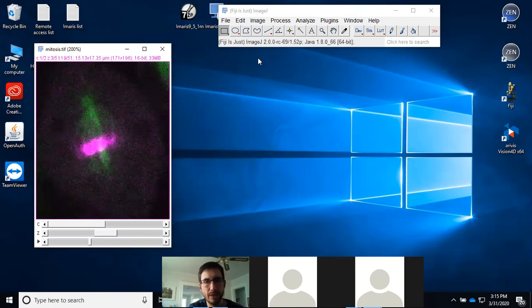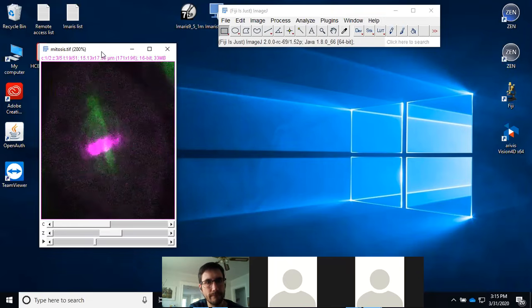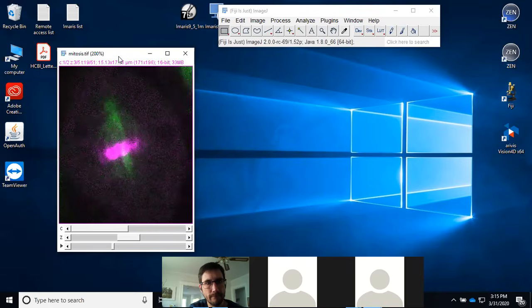Question. Yes. May I ask a question? Yeah. So I'm seeing both channels, yet I don't see all the Z stacks. What happens if I toggle the channels between one channel and the other one? Yes. So right now, nothing happens. And that's a good question.